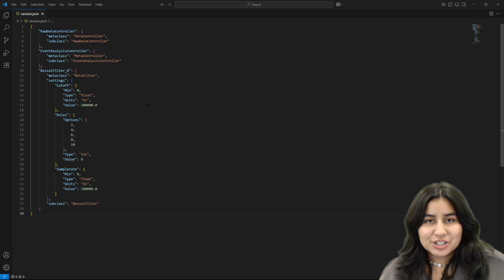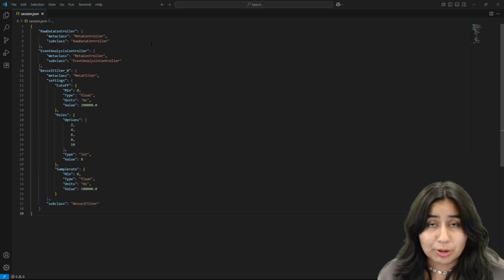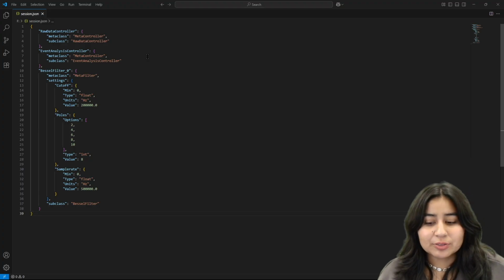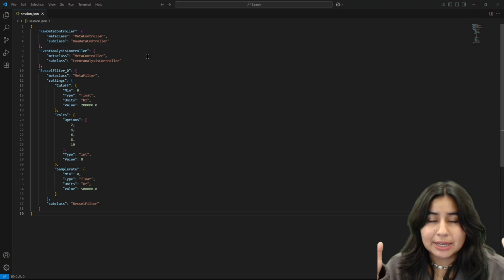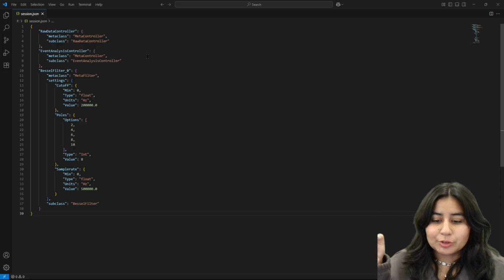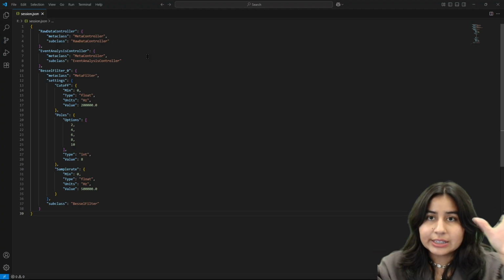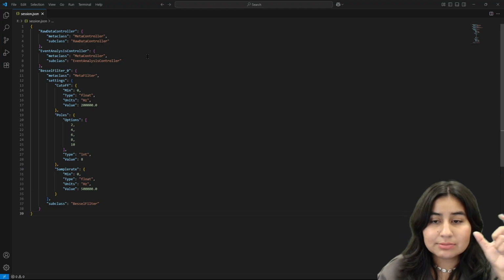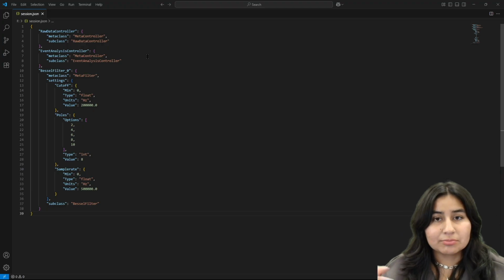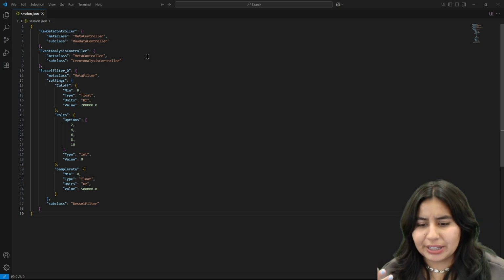Sessions are, as you can see, JSON files. Therefore, they are very lightweight and portable. So they're perfect for saving your place in an analysis pipeline. What I mean by this is that you can think of the analysis pipeline as a series of milestones. You have your raw data, your event analysis, your metadata, your clustering, and in each of these tabs, you are following a series of steps. You are loading your data, but then for instance, you are plotting seconds of your data.